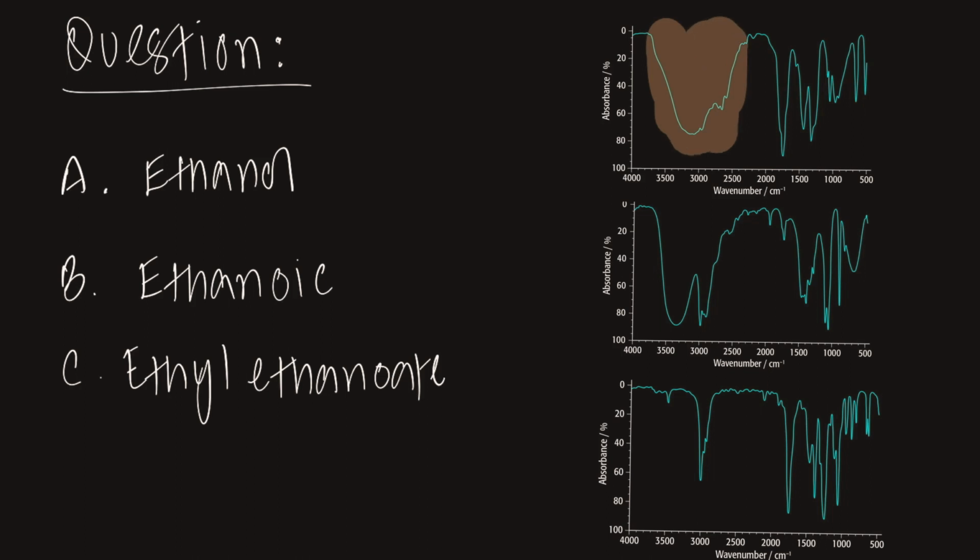Very unique, very different from my lobe. That lobe shape comes back. I call it a lobe because it looks like the lower part of an ear. That's an earlobe. Anyway. And in the third one, I have nothing characteristic. So what options do I have?